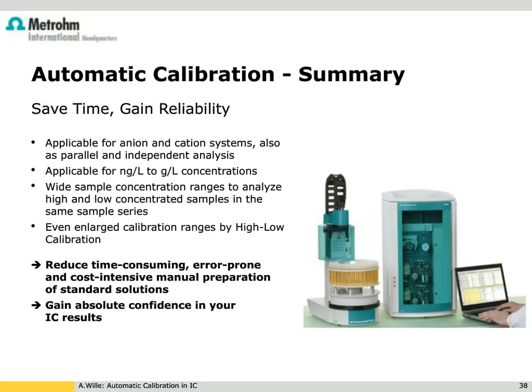If this is working well, then of course the noise could come from the pump, so maintenance of the pump could be necessary. But in general, it all depends also on the quality of the chemicals, so ultrapure water should be used, and the quality of the salts used for the eluent preparation should be high enough that you have no contamination by other impurities.